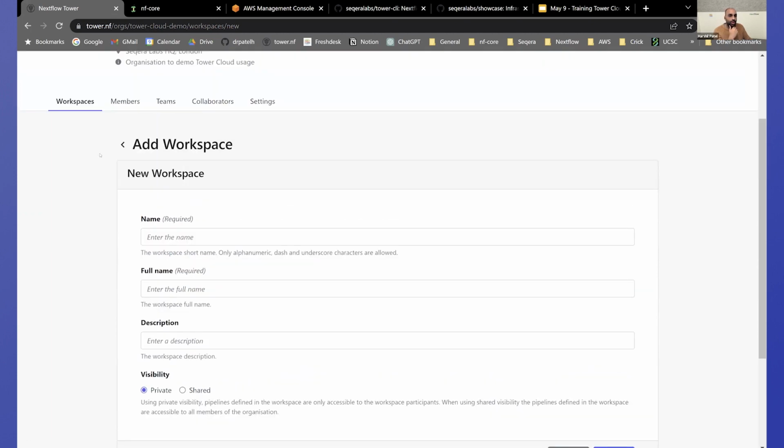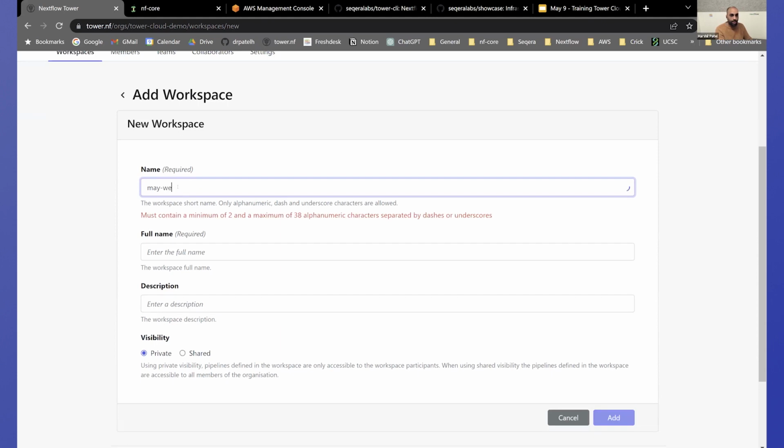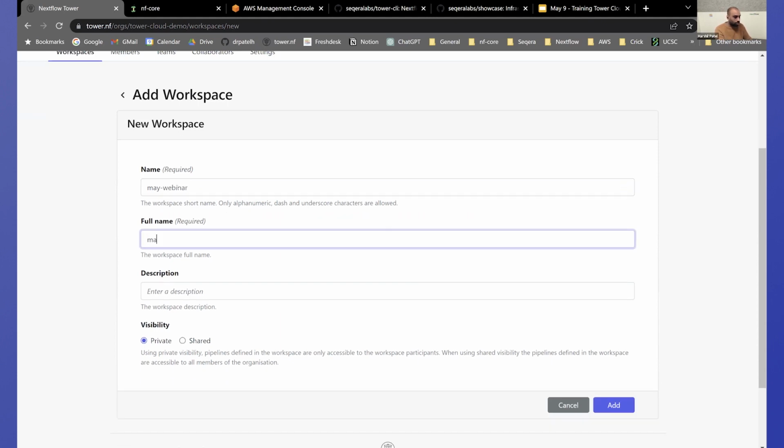And so I'm going to add a new workspace to this new organization, and I'm going to call it May Webinar. I'm going to name it the same.